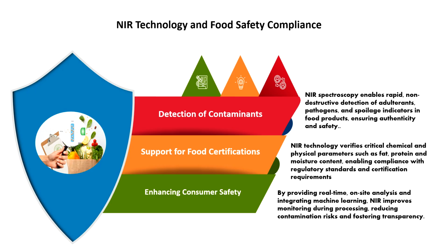NIR technology and food safety compliance. NIR spectroscopy enables rapid, non-destructive detection of adulterants, pathogens, and spoilage indicators in food products, ensuring authenticity and safety. Second, it also helps in the support for food certifications. NIR technology verifies critical chemical and physical parameters such as fat, protein, moisture content, enabling compliance with regulatory standards and certification requirements.